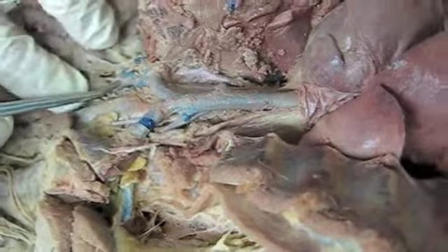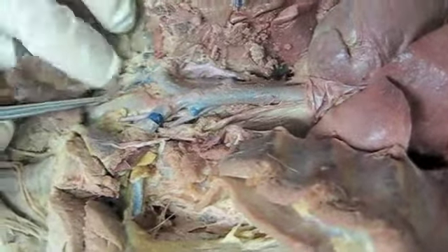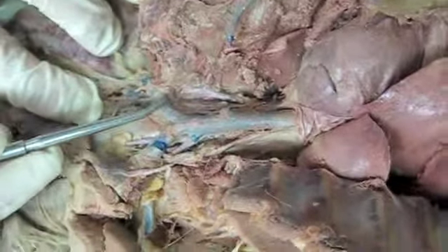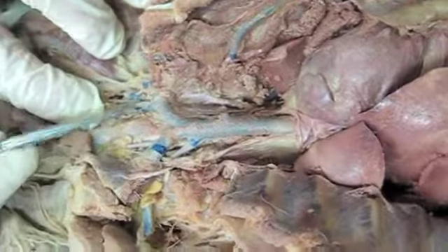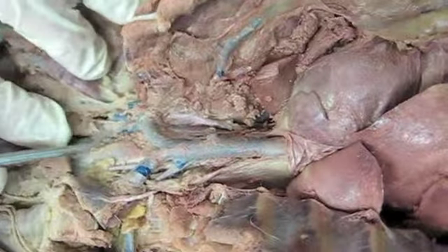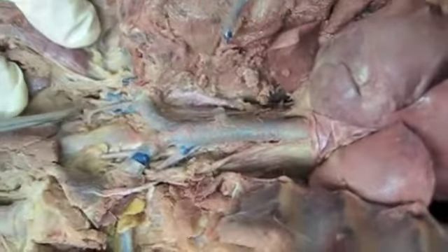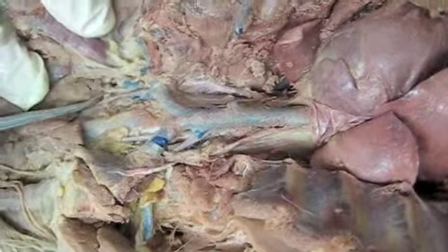But if I come here, you can see this red artery right up here. It's coming off the subclavian up here, and then it goes underneath all of these veins, and then it starts to emerge there. So that's the thyrocervical artery.